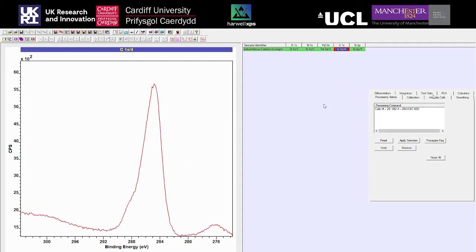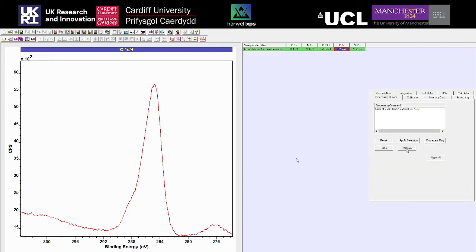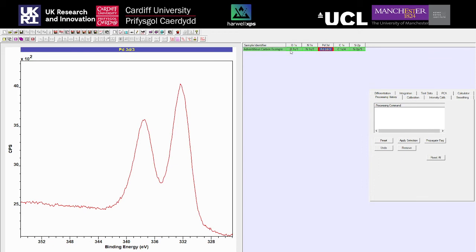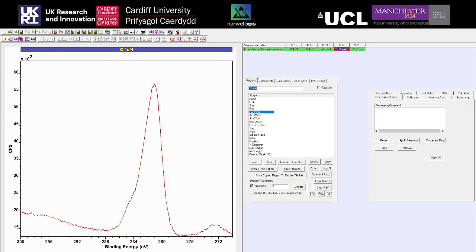That's one way to calibrate - simply click and apply to all blocks. Now I'm going to remove this calibration. If I right-click on the spectrum I can propagate the processing - there's no processing done to this now since I removed it. I'm going to propagate that to the other blocks, which will remove the calibration from every single block.